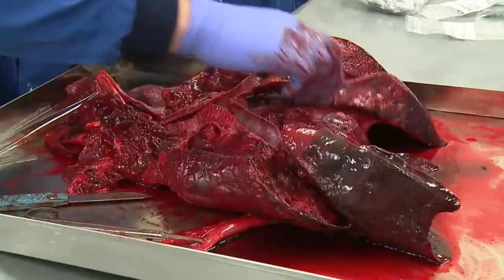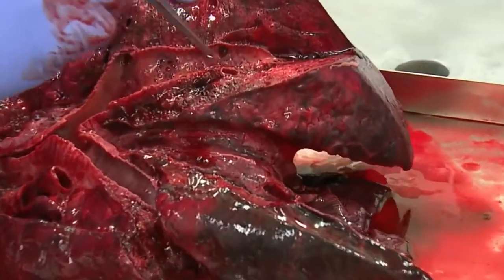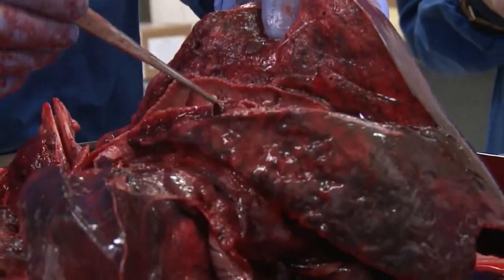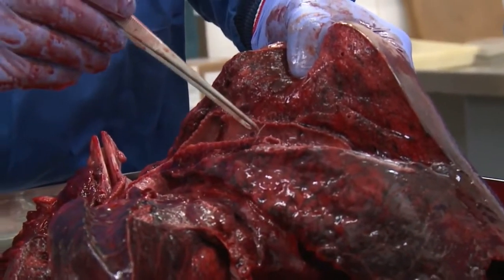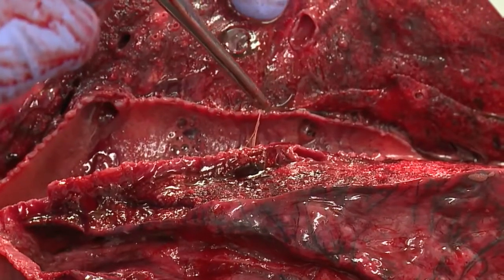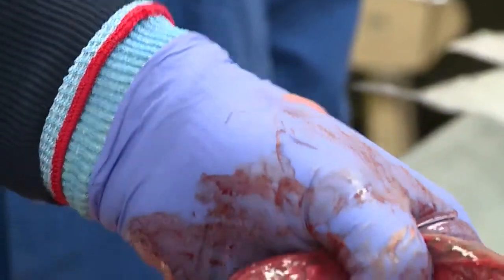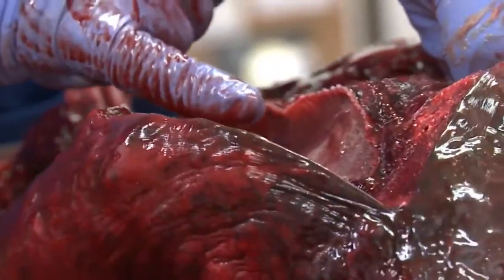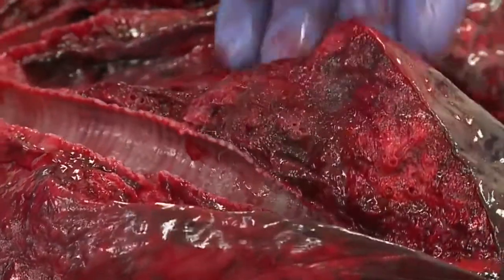The other thing we can perhaps see, if one of those cameras can pick it out, I know you like a nice parasite, is just here, these little thread-like parasites coming out. Is that clear on the camera? Maybe. These are probably a species called Halocercus delphini. Just in the back of my glove, there's one of them, that little thread-like parasite. We will assess the relative burden. It's the relative burden that's important. Is it heavy? Is it light? Is it moderate? There's one there for the camera over that side, just my little finger pointing it out. And this is obviously light.